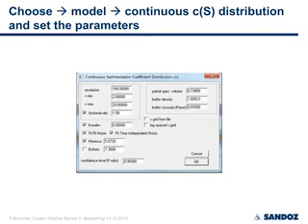I prefer to set the resolution to 100, so the size distribution is cut into 100 slices, and the Lamm equation is solved for 100 species in there. This is usually sufficient if you look at one order of S, so let's say from 1 to 10 or from 2 to 20S, and this is also the maximum in my experience which you can get out of a single speed.